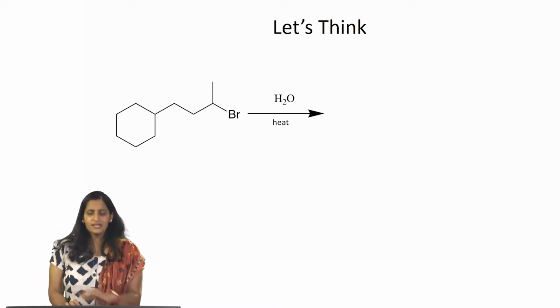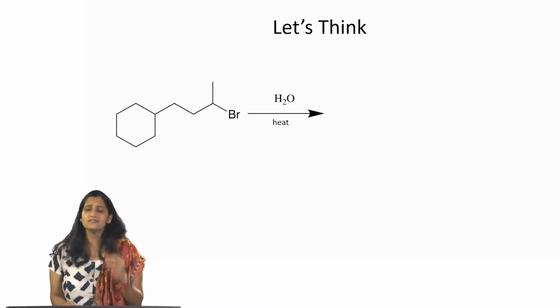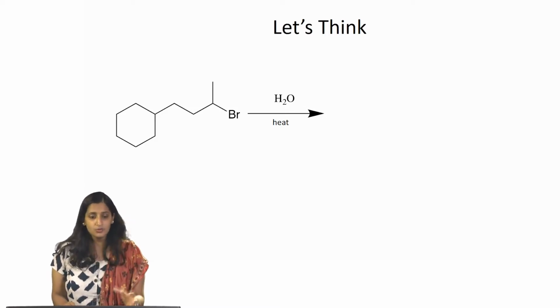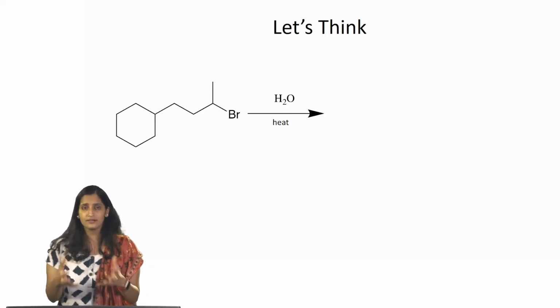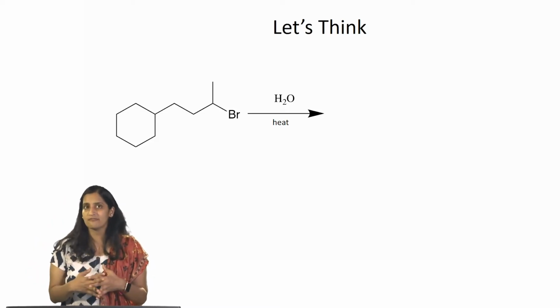We are going to talk about spectroscopy techniques, and today I will be introducing infrared spectroscopy. But before we really start talking about spectroscopy, I want to go over why it is important to know these techniques and what crucial role they play in an organic chemist's life.